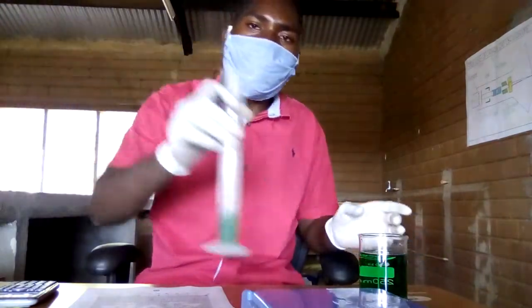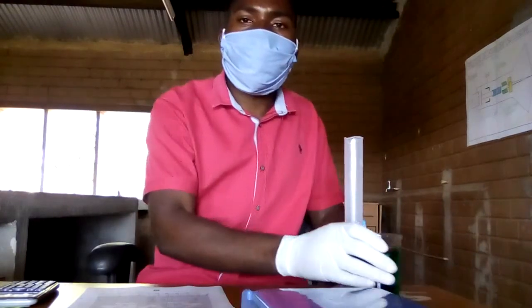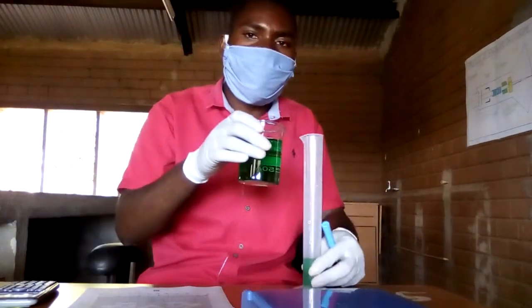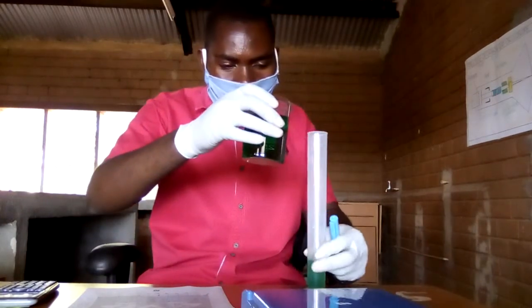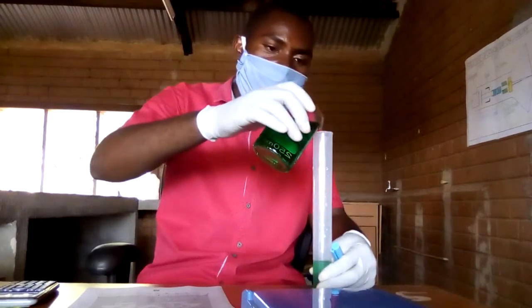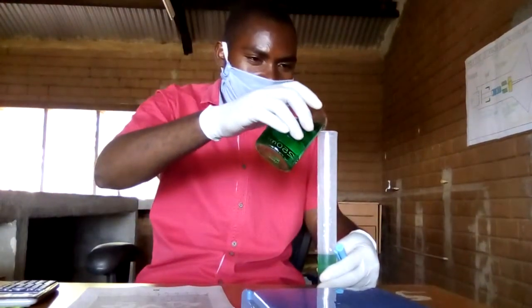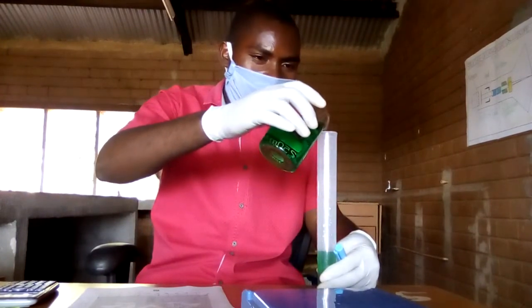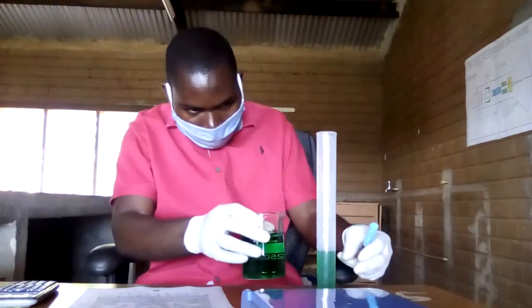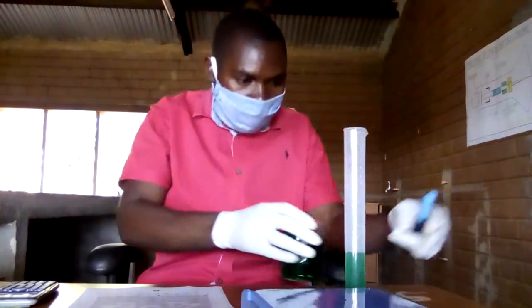Then again you're going to measure the volume of liquid P, about 30 cubic centimeters now. So on 20 you are just going to add 10. So this is what I've done. Okay, still going. Okay, yes or no? Yes.